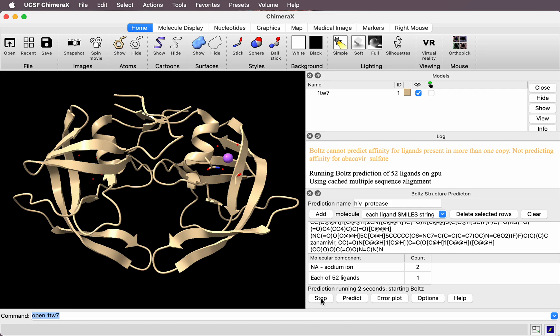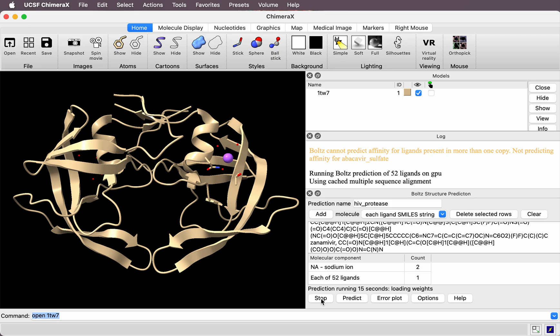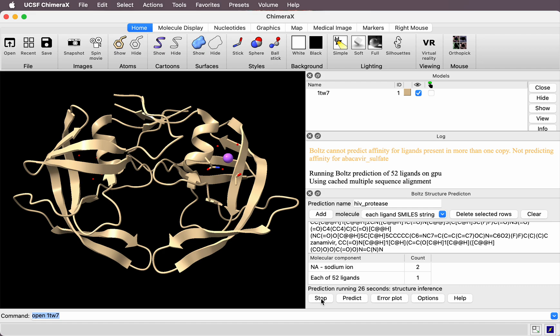These predictions are going to be run one at a time. It's not going to use the structure I've opened—it's only using the sequence. It will predict the full protein structure, which will come out quite similar to this experimental structure. It will take about two hours on this Mac M2 Ultra. On a Linux system with NVIDIA 4090, it took 14 minutes to predict all 52.